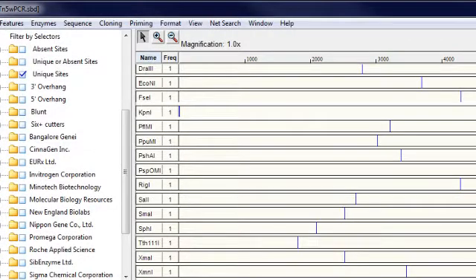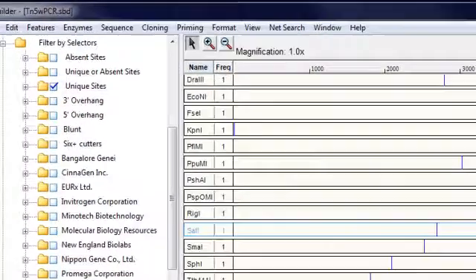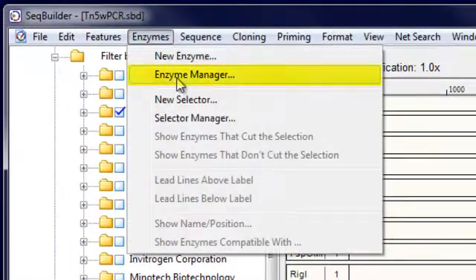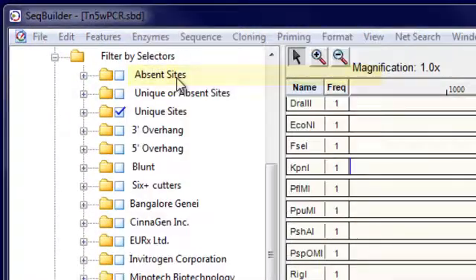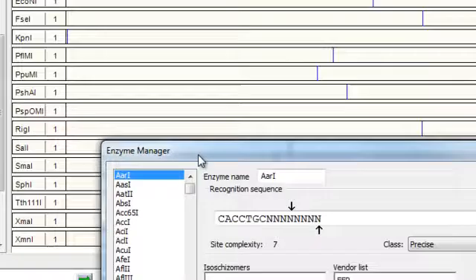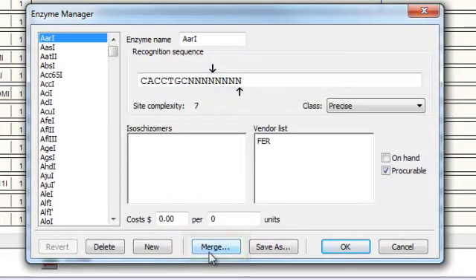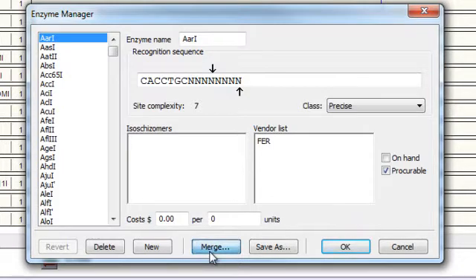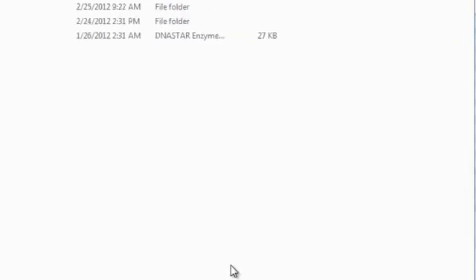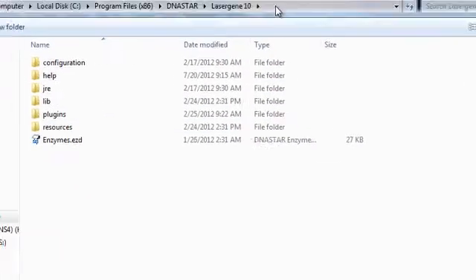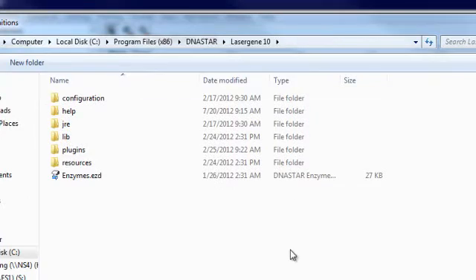Finally, if you want to add enzymes from another enzyme file, go to Enzymes, Enzyme Manager to open the Enzyme Manager again. And then click the Merge button. And what this will do is add enzymes from another enzyme file to your enzyme catalog without deleting any of the custom enzyme data you've added.